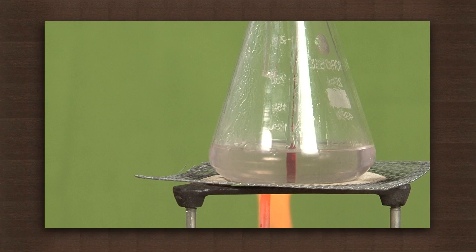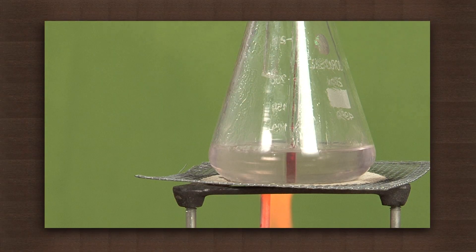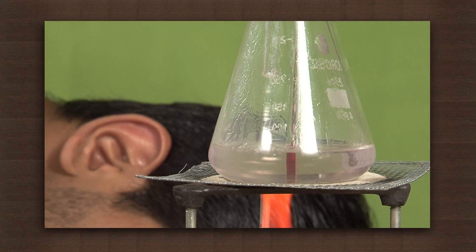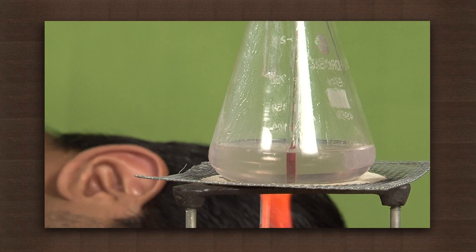Heat the flask till the mixture starts boiling. Since alcohol and water have a significant difference in the boiling point, they will boil at different temperatures. Alcohol which will boil at a lower temperature will first turn to vapor completely while water will remain in the liquid state at that temperature and hence they will get separated.